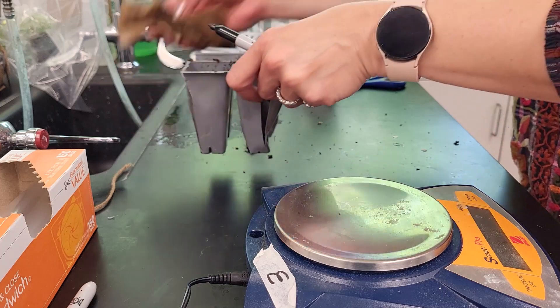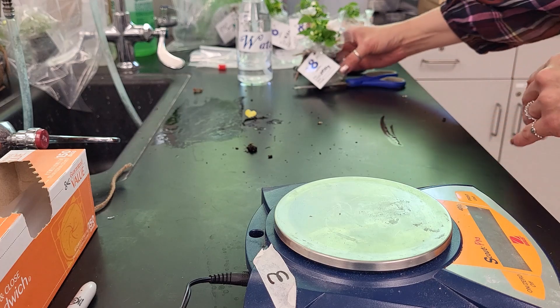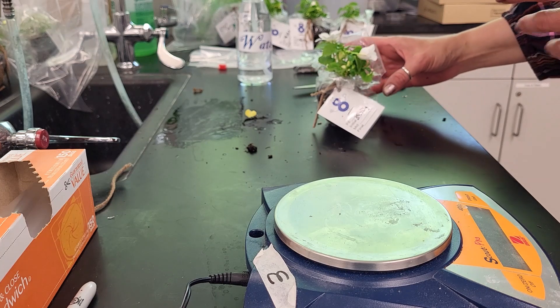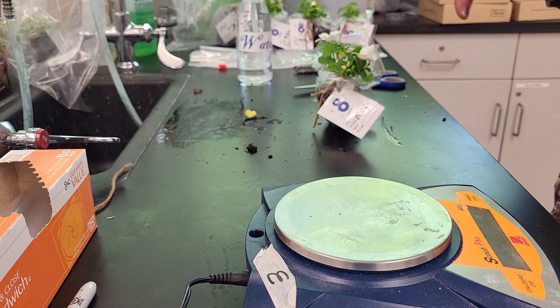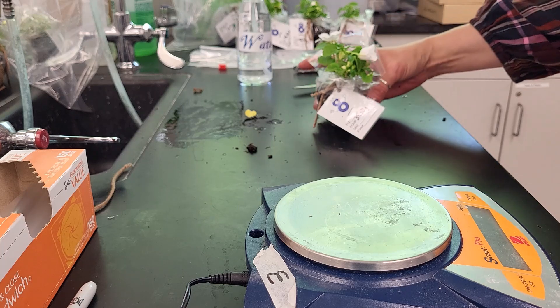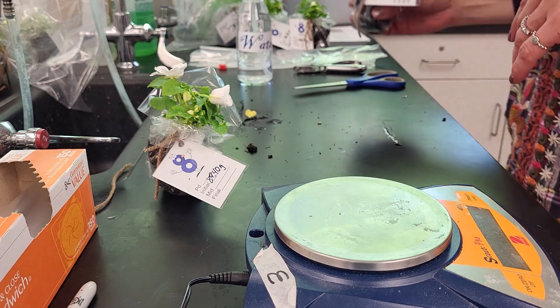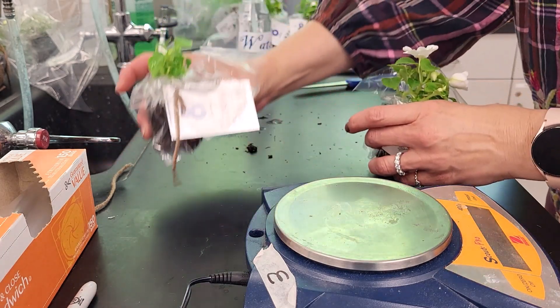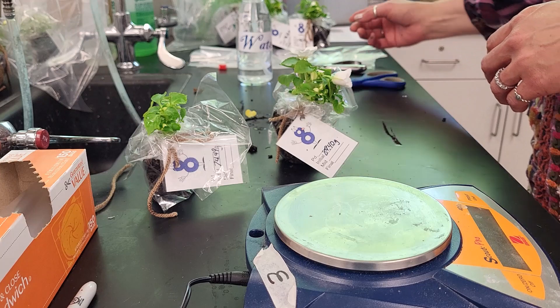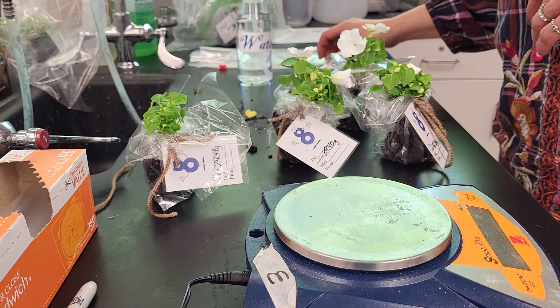Now that we've got all of our plants in their bags, we're going to put them in the different conditions. It does recommend removing the flowers, but you don't have to — just consider that if flowers fall off, you'll want to mass those as well. One plant is going to stay in our room conditions as our control. One is going to go in the light, one is going to go in an area with a fan, and one is going to go into an area with mist.